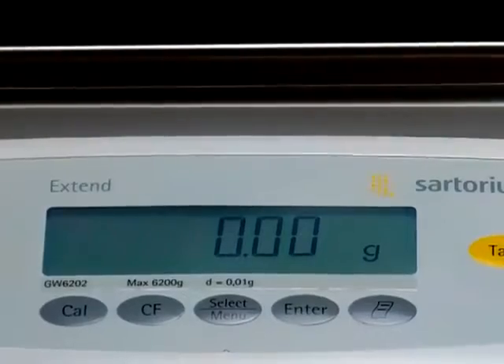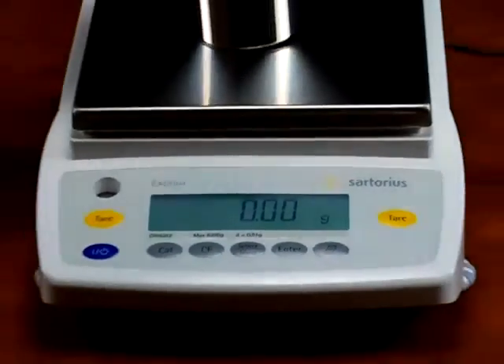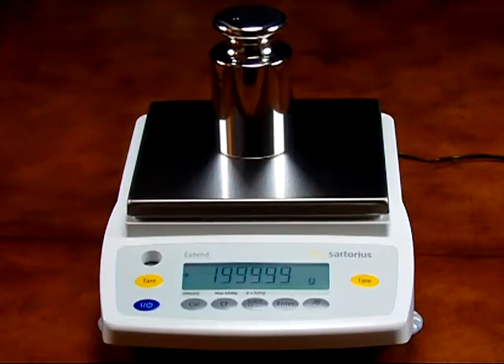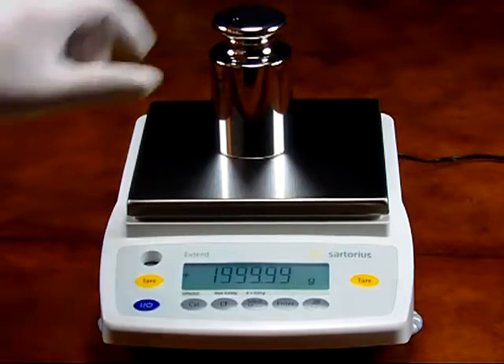We have a 2 kilogram calibration mass — place it on the center of the balance. The balance has a tolerance of plus or minus 0.01 grams. That's within tolerance.